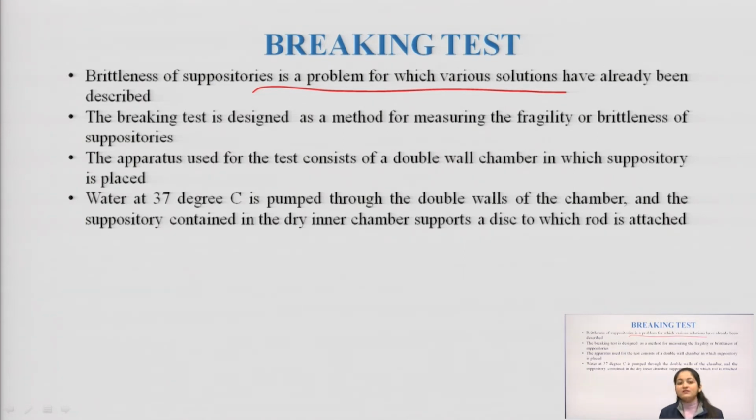We just saw the melting apparatuses, we just saw the breaking point, we just saw the liquefaction temperature. So, brittleness has already been studied through various parameters. This is another test. The breaking test is designed as a method for measuring the fragility and brittleness of that particular suppository.